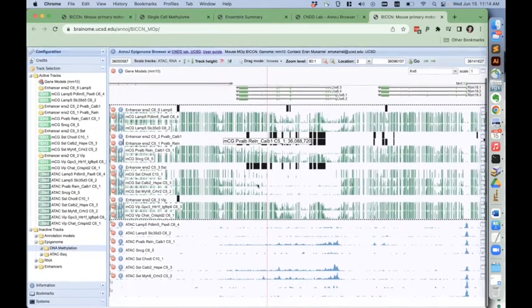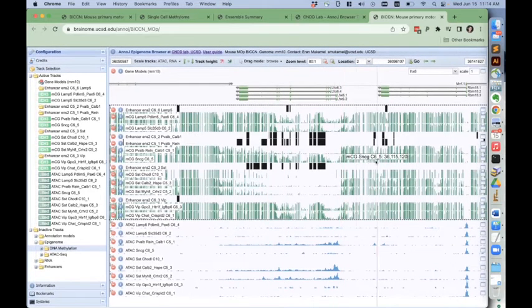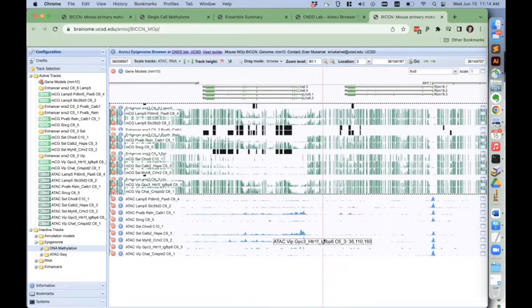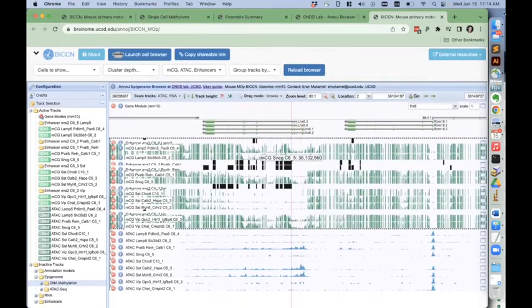But before we get into that, let me scroll down here and look at the ATAC-seq data. So we also are showing on the same screen the ATAC-seq tracks from the same cells in the same order. And what you see is the same cell types that have low DNA methylation, such as SST-CALB2, SST-MYH8, also have high levels of ATAC-seq open chromatin, again, at the promoter and throughout the gene body.